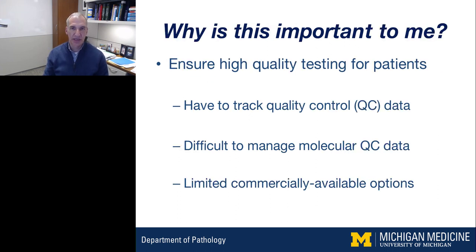So this topic is really important to me, and I wanted to share with you a few points of why I wanted to present. As you all know, QA programs are important to ensure high quality testing for our patients, and we have to track QC data not only to ensure that we're doing the right thing, but there are regulatory requirements from organizations like, for our lab, the College of American Pathologists, and those organizations require daily monitoring to ensure test accuracy and high quality performance, as well as longitudinal monitoring to look at trends and potentially identify biases.